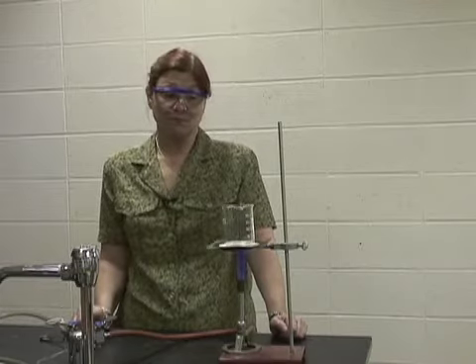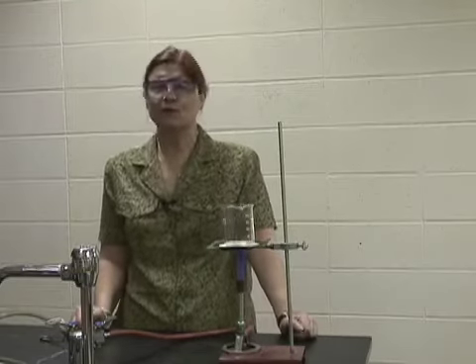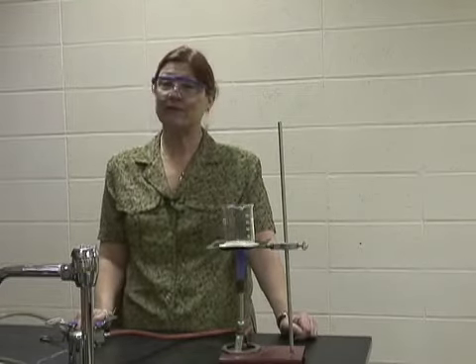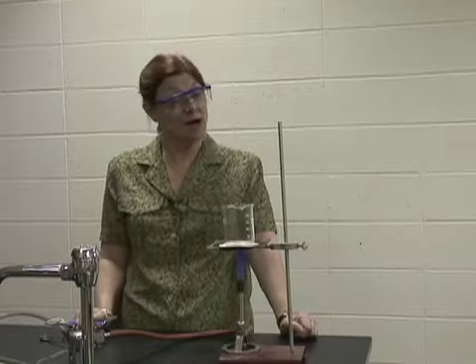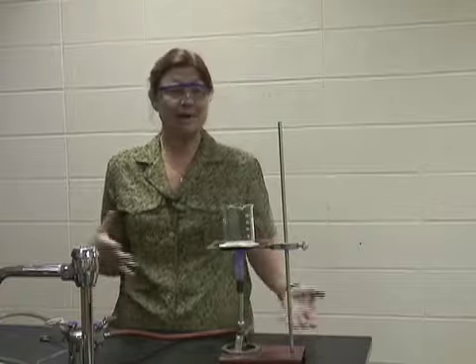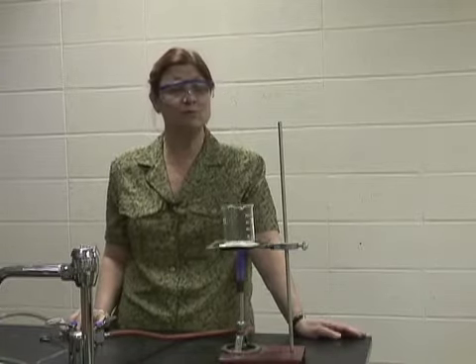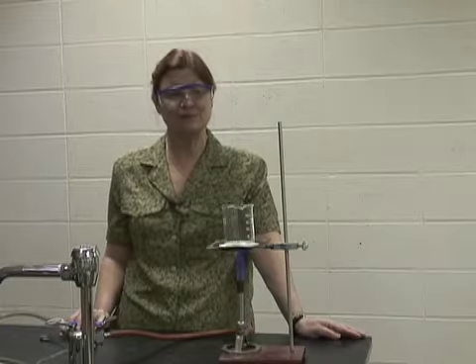Well, also, this is an empirical formula lab. This is a very, very important lab because it has some concepts in it that are very, very critical and very basic. We use them even in our upper level classes. Empirical formula is one of the major types of labs that we can do.